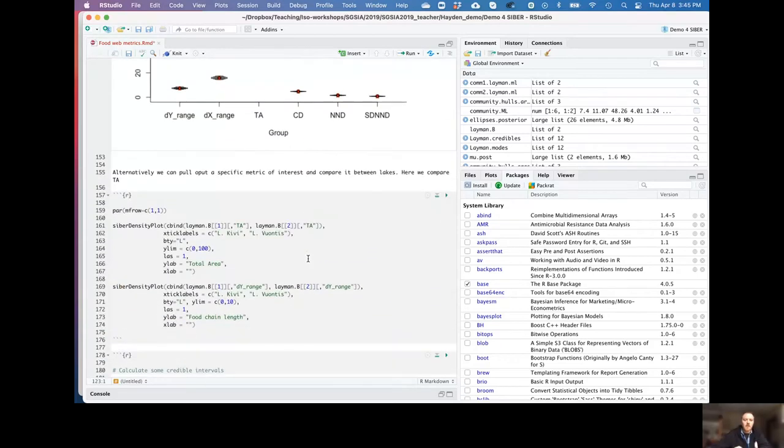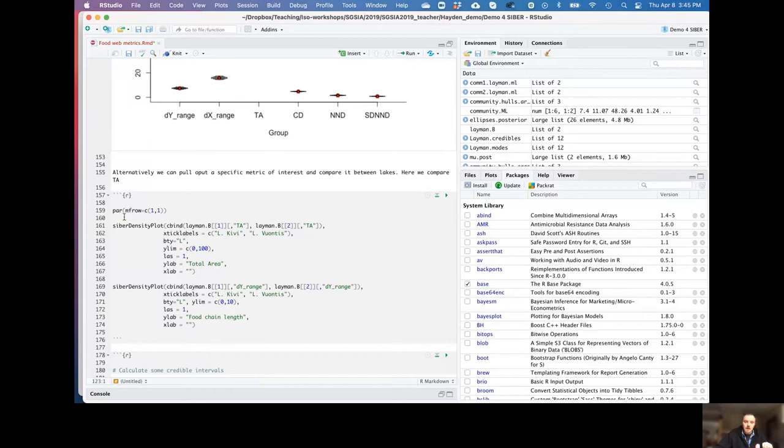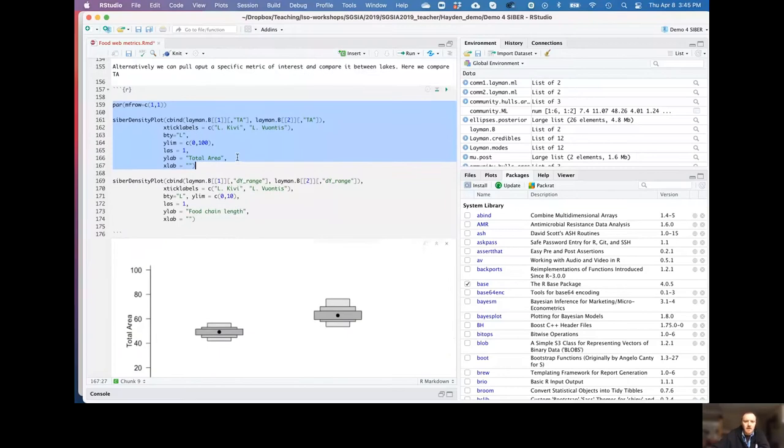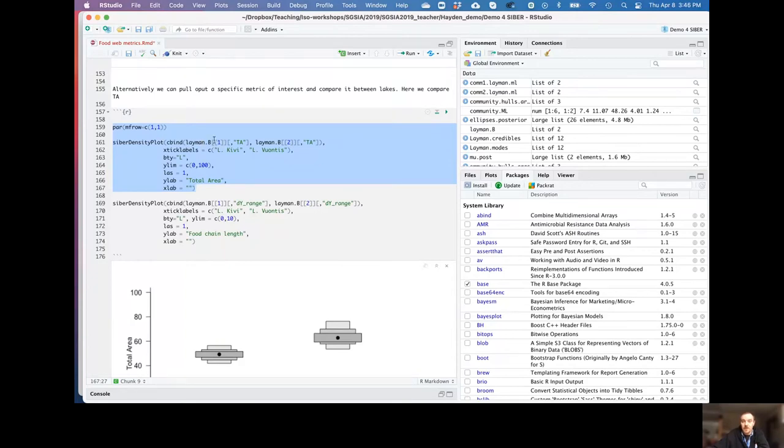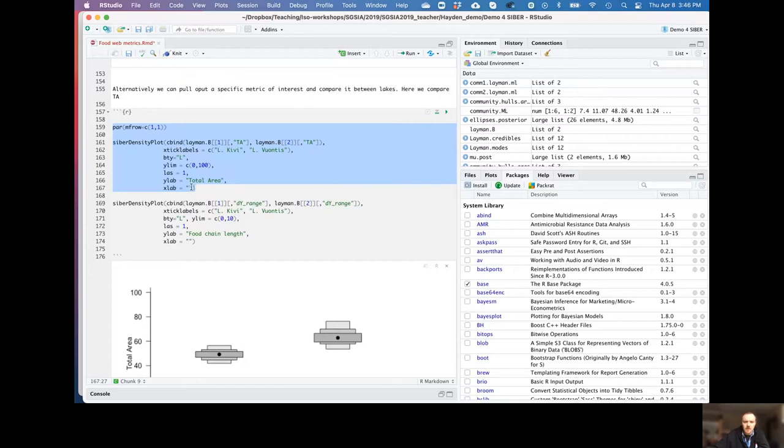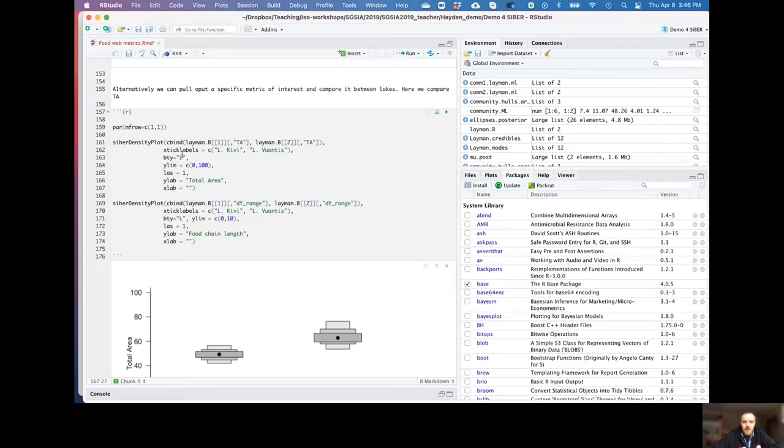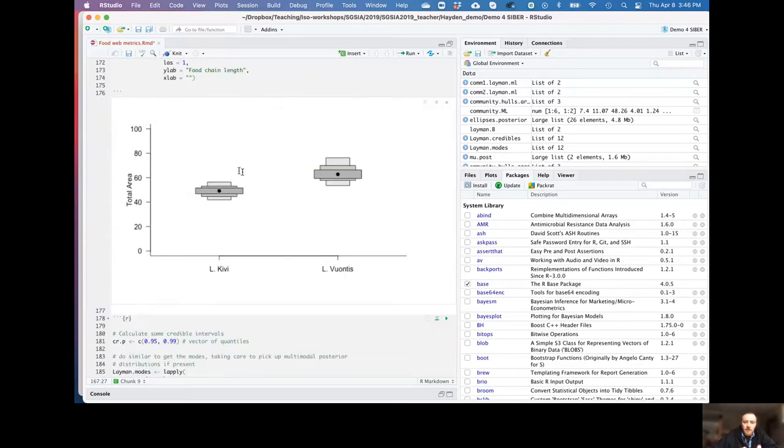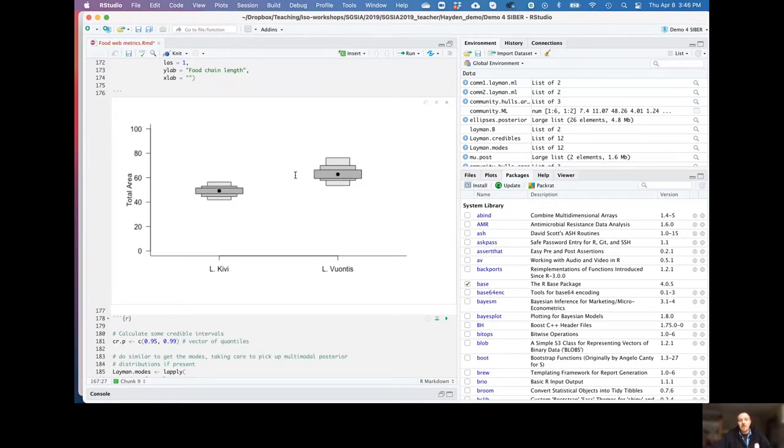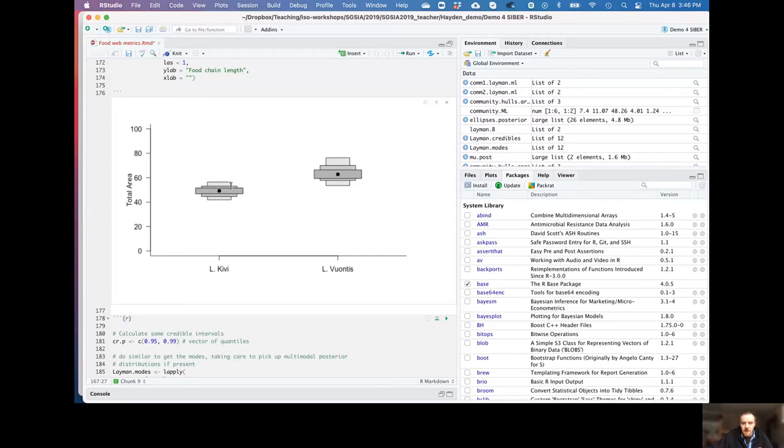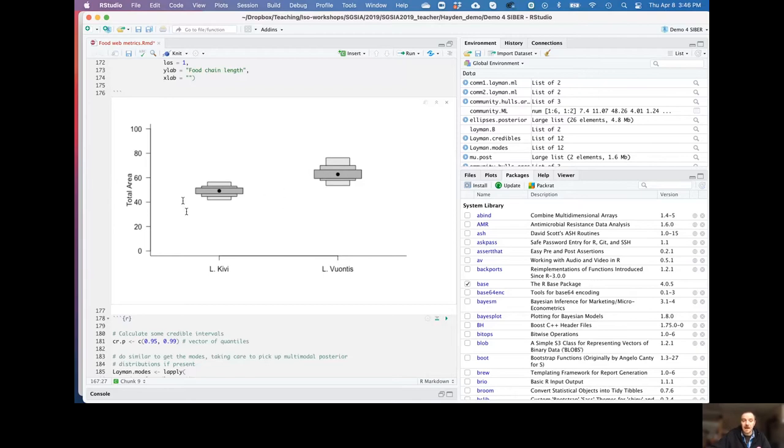So alternatively, what if we want to do an actual comparison between systems? So again, here we can just by changing the call around a little bit. So here what we're doing, we're doing a SIBER density plot, but we're binding together from Layman metric for lake one total area and Layman metric for group two or lake two total area. We're labeling these Lake Kivi, Lake Vuontis, putting some other characteristics into the plot. Play it through, let it run. And here we can see Lake Vuontis. It's an easy way to make that comparison between the two systems.